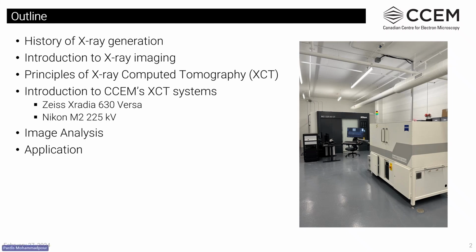Okay, here is what I'm going to cover in today's webinar. I'll give a history of X-ray generation, which will be followed by an introduction to X-ray imaging. Then I'll talk about X-ray computed tomography or XCT. And then I'll introduce our new XCT systems in the CCEM. Afterwards, I'll discuss the data reconstruction, image processing, and XCT application.